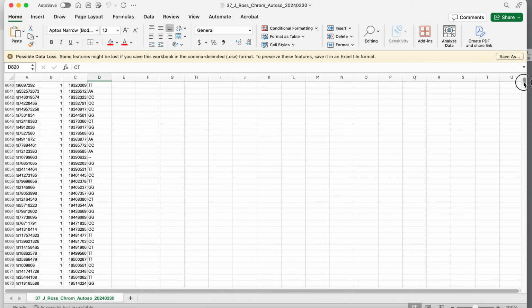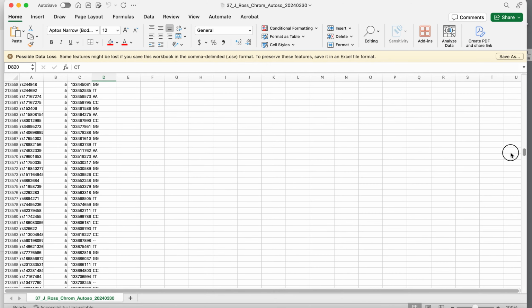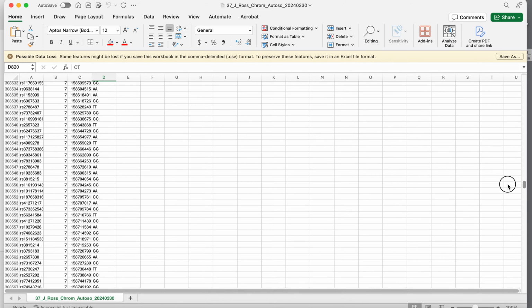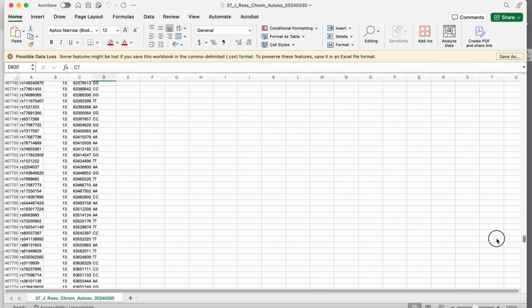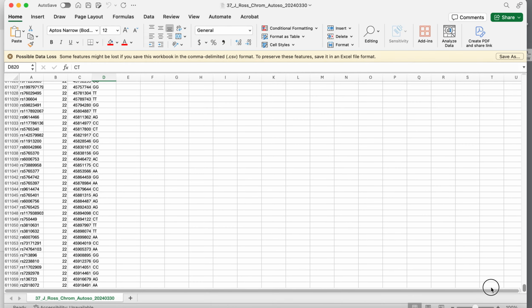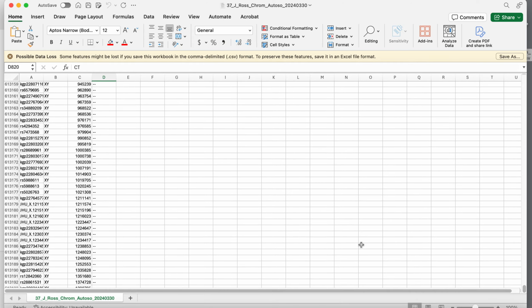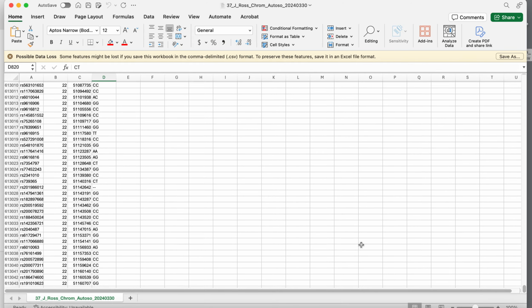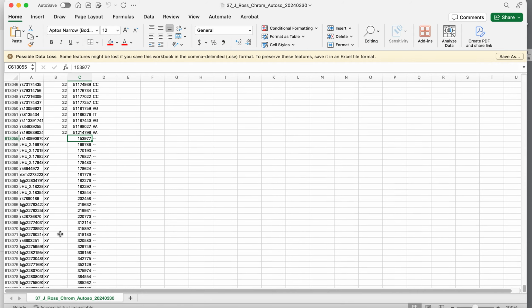And if we scroll down, you'll find that we eventually get to chromosome 2, 3, 4, 5, and so forth. And you can keep scrolling to find the genotypes at all of these different SNP loci, the RS numbers, on all of the human autosomes through chromosome 22. And then we have the XY pair starting at the 613,055th locus that was genotyped.